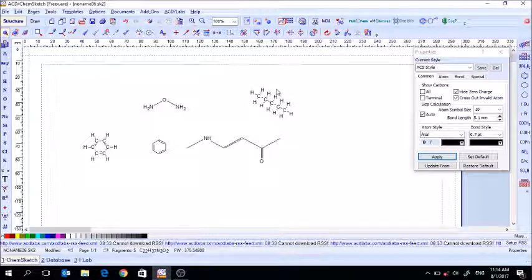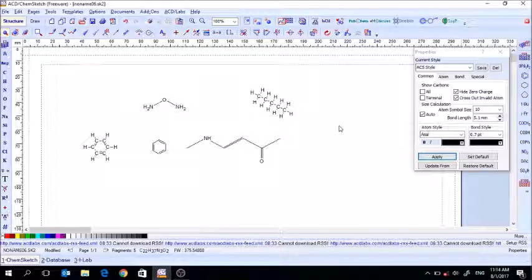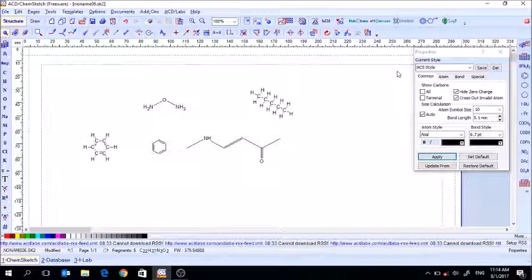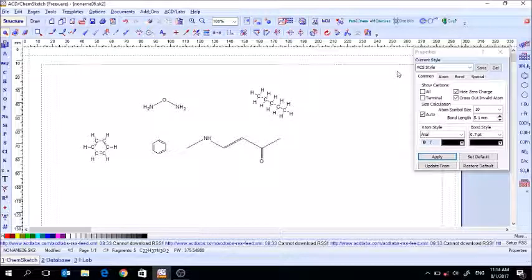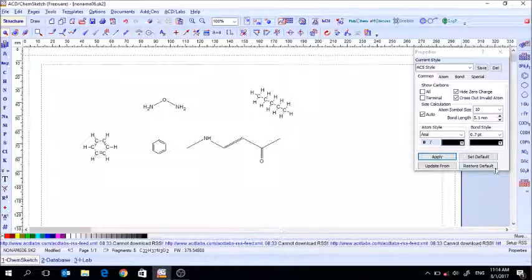That pretty much concludes the basic structure drawing. There are lots more things you can do in ChemSketch, and this will be split into a couple of different videos. Next time a few more features will be covered.